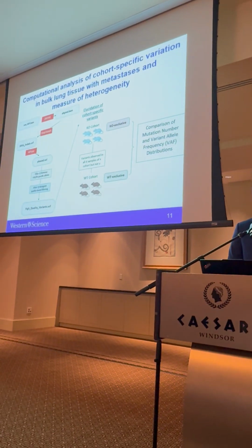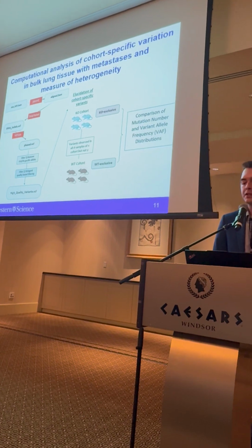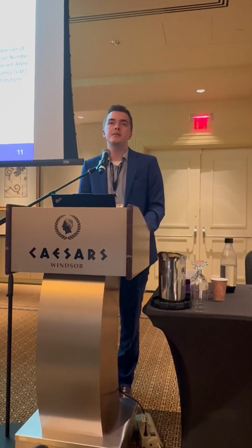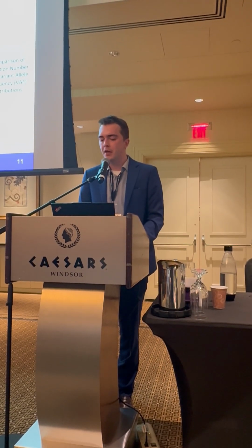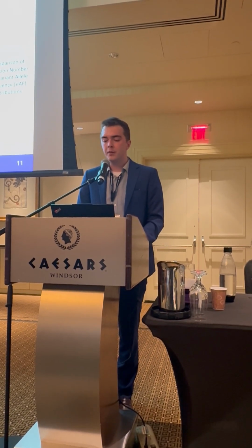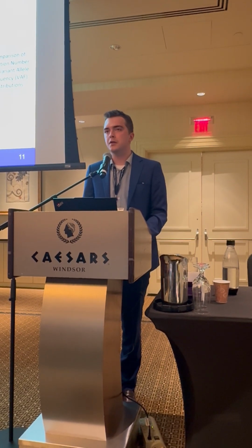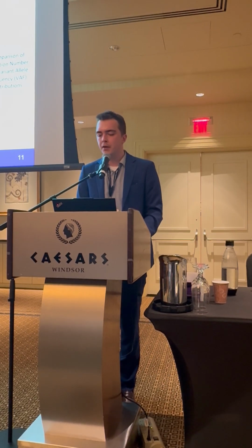All right, following sequencing, I processed these reads through the following bioinformatics pipeline. First, aligning the reads to the mm39 reference genome that corresponds to the B6 background, which is the gold standard for these mouse genomic analyses. Then I performed variant calling with DeepVariant, focusing specifically on the SNVs and indels, with more characterization of the structural variants ongoing right now.